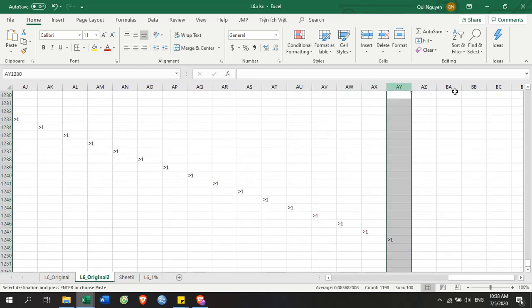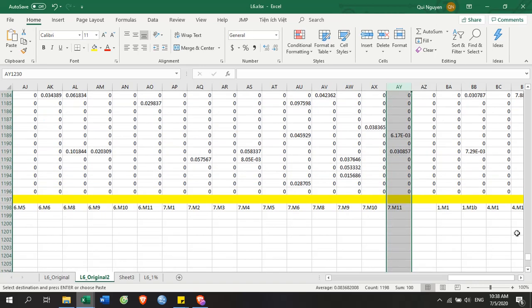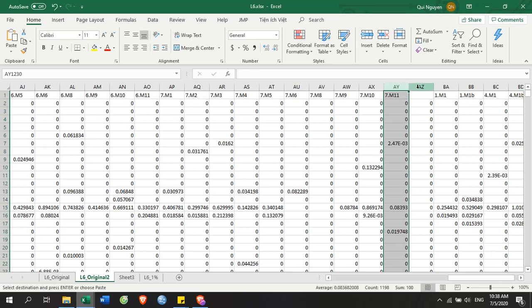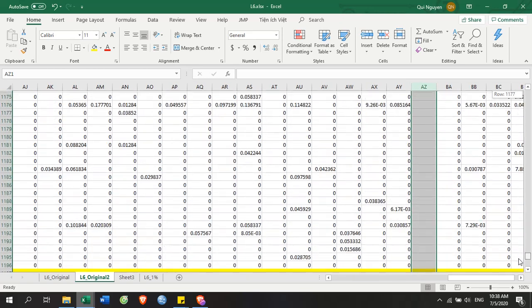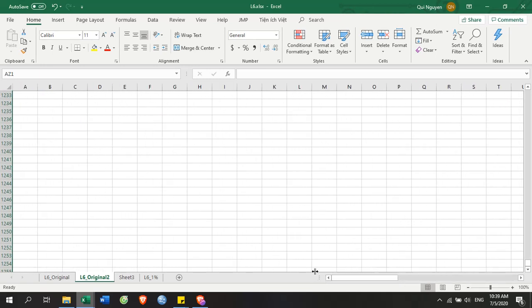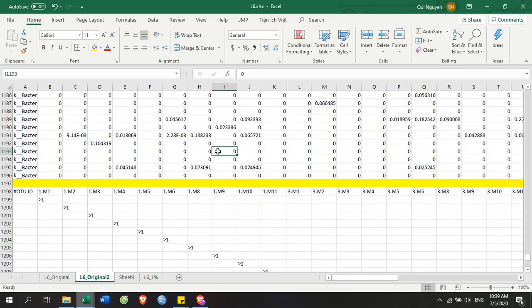Here you can see the sample is finished here. Now I don't want to handle this data, so the filter will stop here until you finish the final sample. And then you already create the criteria range. And next, you will filter your data.